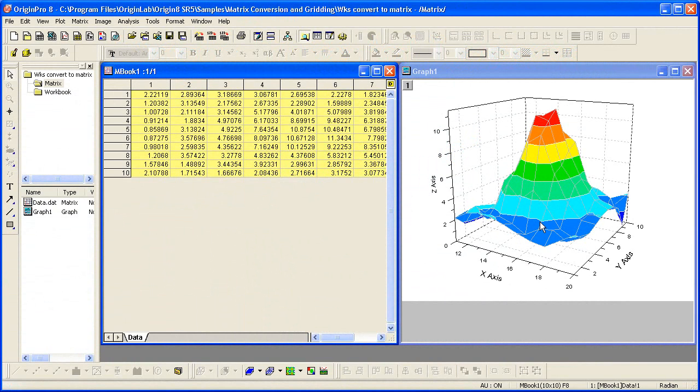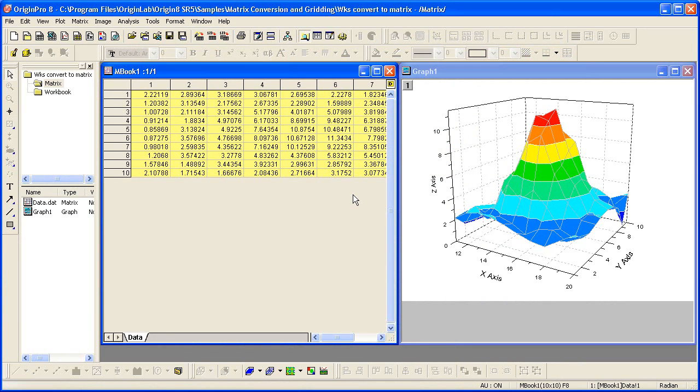Matrices have numbered columns which are mapped to linearly spaced X values and numbered rows which are mapped to linearly spaced Y values. Each cell value in a matrix represents a Z value.